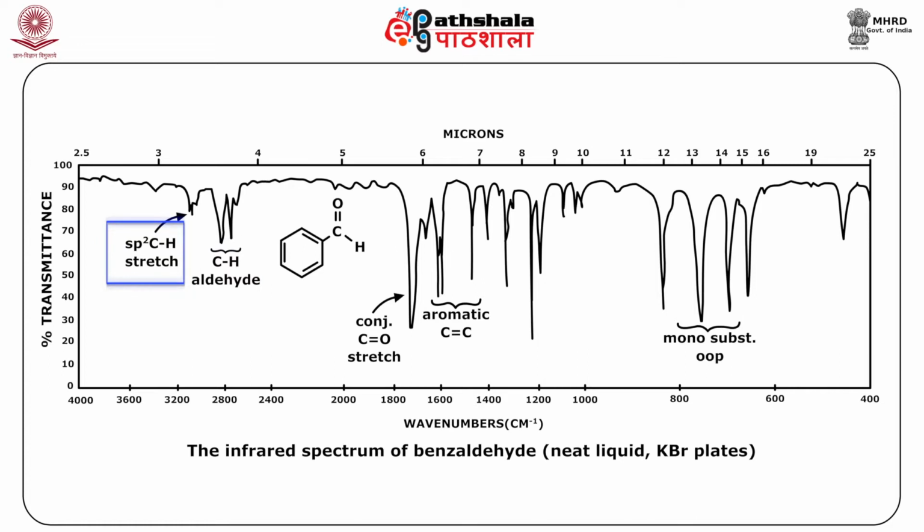The higher C-H stretching band, which is in the range of 2860 to 2800 cm⁻¹ of aldehyde, is often buried under the aliphatic C-H band. But the lower C-H band, which is in the range of 2760 to 2700 cm⁻¹, is usually used to distinguish aldehydes from other carbonyl-containing compounds. The C-H bending vibrations appear between 945 to 780 cm⁻¹.